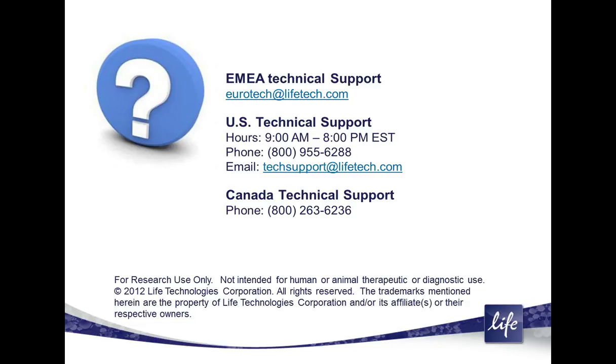Yes, we did focus a lot on mammalian cells, and some of these dyes are compatible with yeast, and I would invite you to come back to our microbiology webinar, and we'll talk more fully about that.